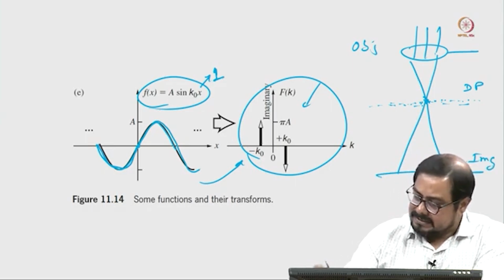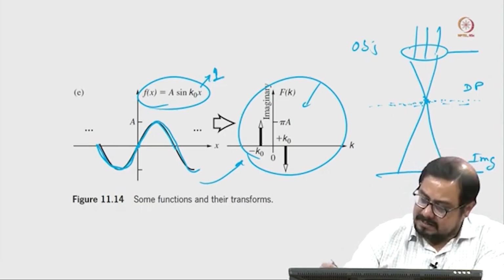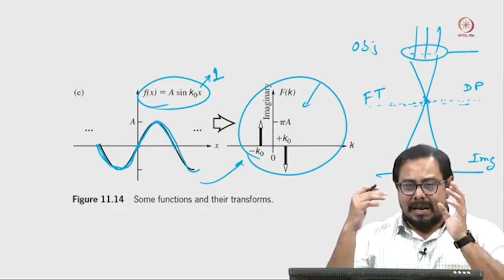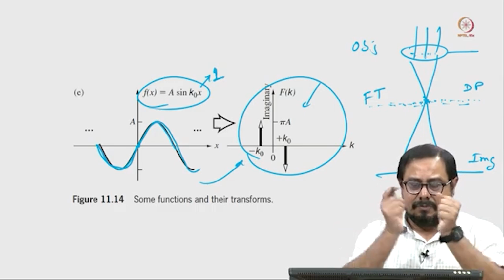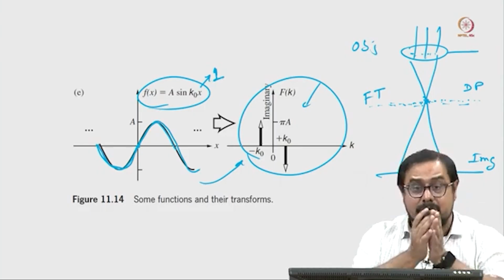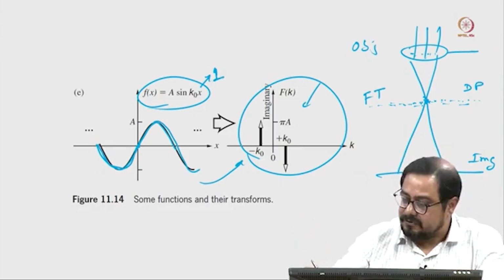What we discussed here is that we are getting the diffraction pattern. We already discussed that the diffraction pattern is basically the Fourier transform of whatever object is there. We are getting some kind of scattered and unscattered electron beam, they converge, and that is a complicated sine cosine curve, they merge together, and finally we are plotting that amplitude. That is, we are constantly talking about that Fourier decomposition. And then if we go further, we are getting that image.